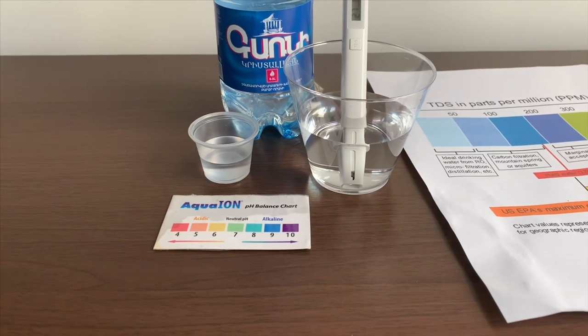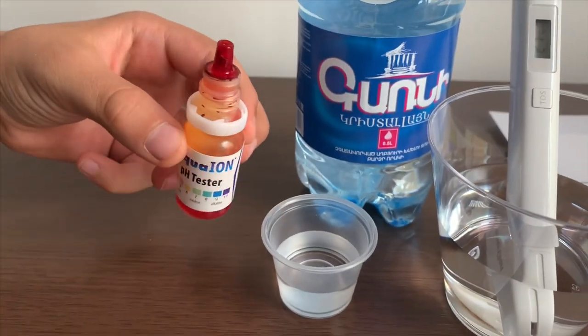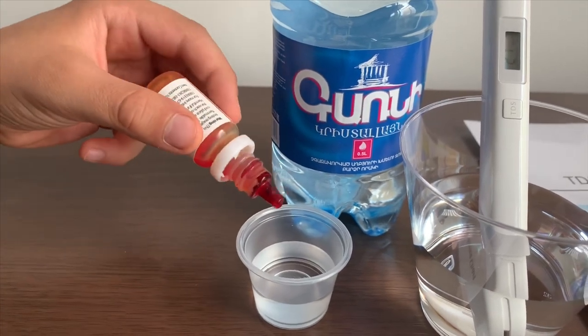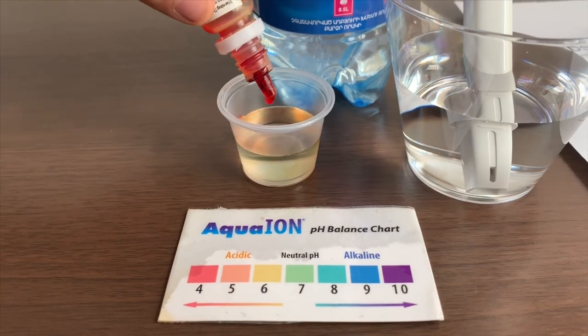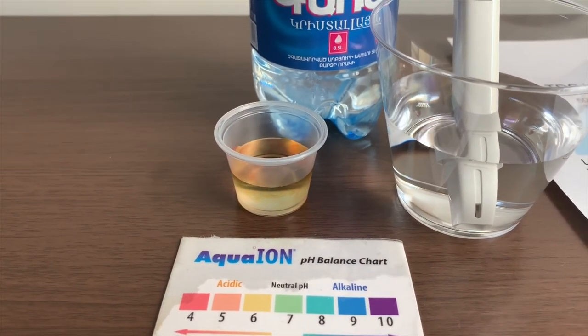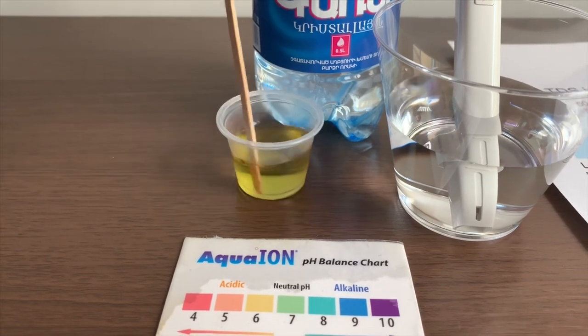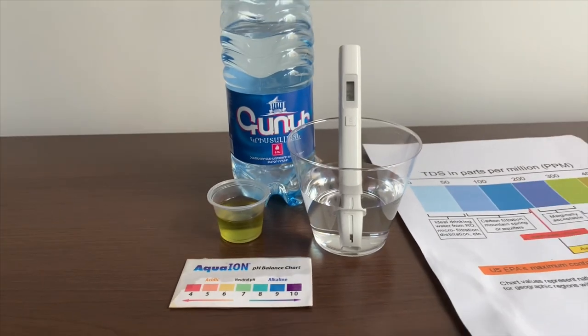Now let's test the pH level. If you want to buy this pH tester, check the link down below. Only do two drops. Let's stir it a little so we'll get a better result. I give this a seven — this is neutral pH.